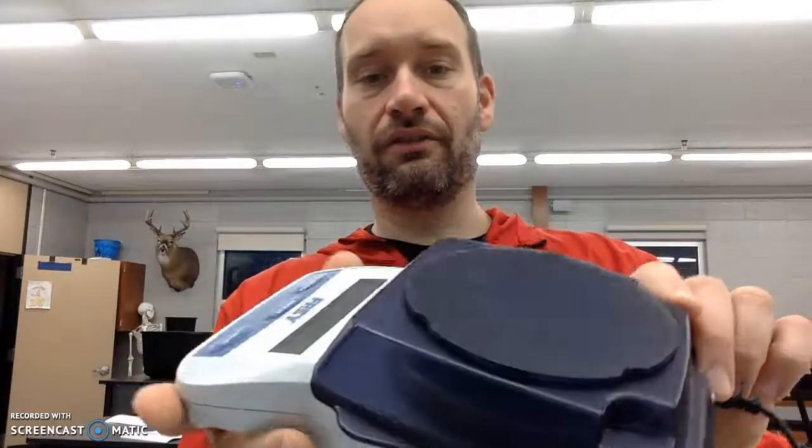Good morning, class. Let's get down to our last day of the osmosis lab and see what happened. So, kind of recap and go over everything. Day one, we put the gummy bears, we massed them on a balance. I didn't use a triple beam balance. I used this balance. Make sure I don't knock too many things over. It's just an automatic balance. It looks like that, so it's nice and quick for me.